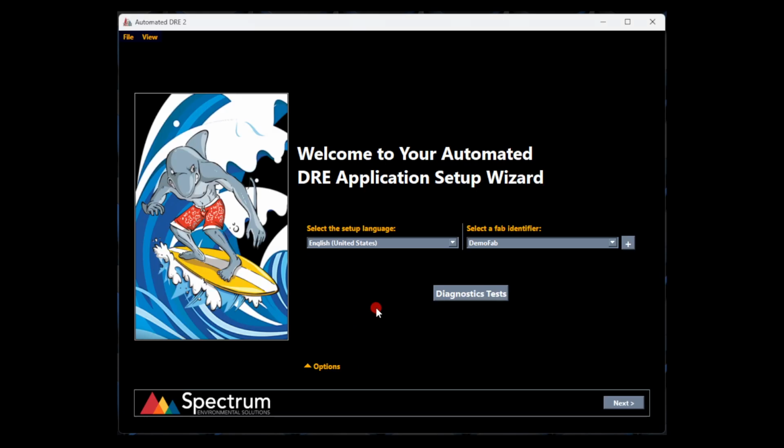Hello all, this is Sean, and this is part 3 of a multi-part series explaining how to update results using the Automated DRE version 2 software. Part 3 will show you how to take a reprocessed SES file from NuWave and load them into the DRE2 program to produce new DRE results.